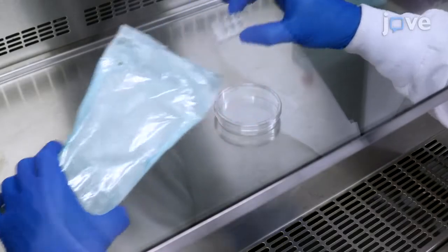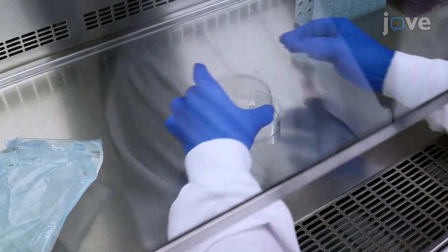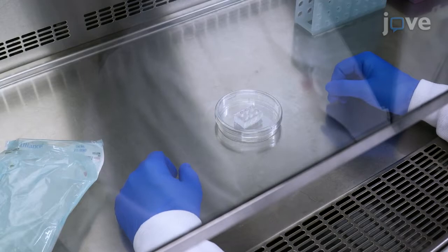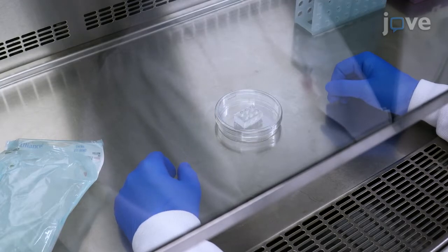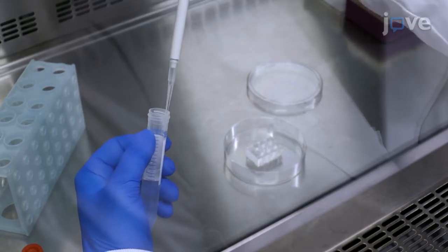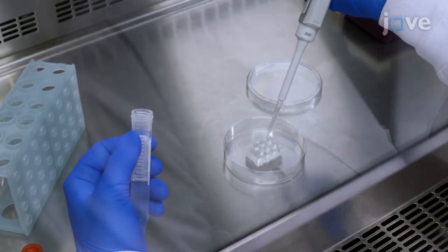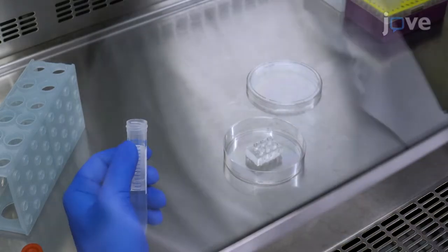Two to three hours before cell seeding, place a six-well myotactic plate portion into a 10-centimeter cell culture dish. Prepare each individual myotactic culture well by adding 100 microliters of a 5% pleuronic F127 solution.